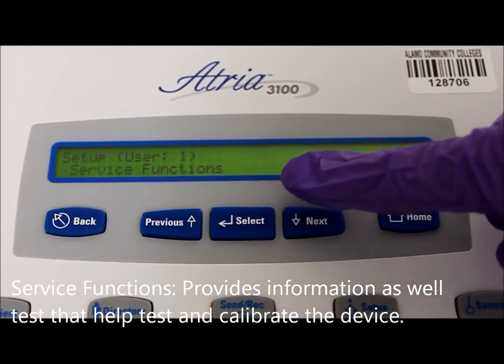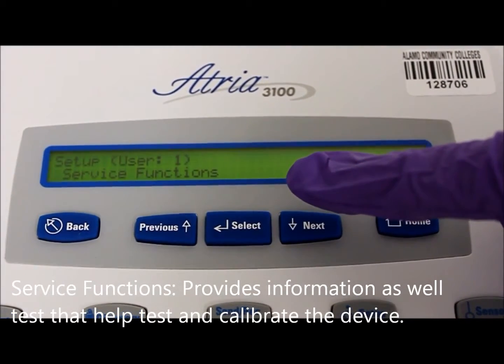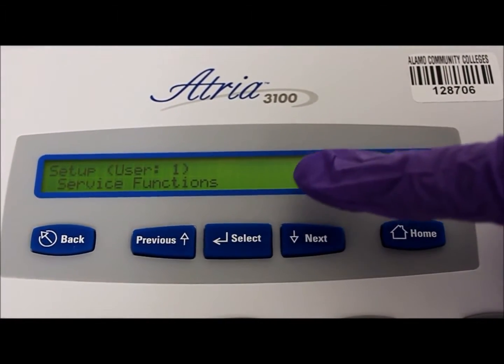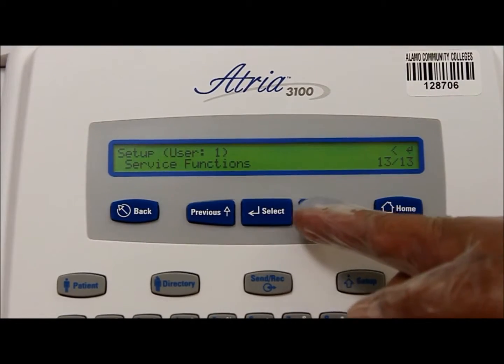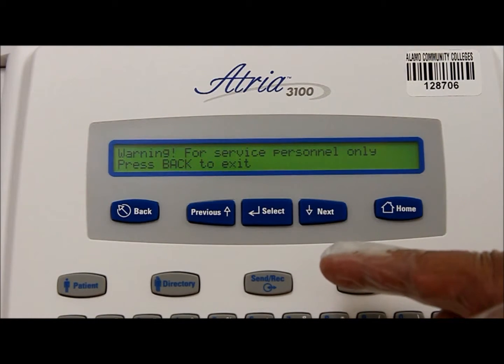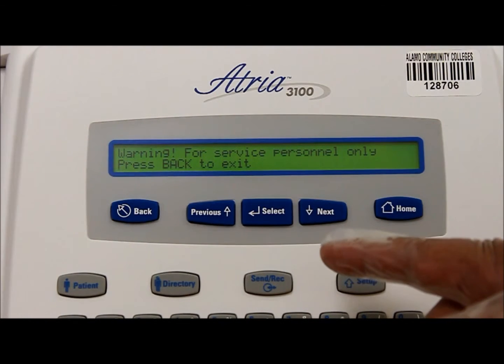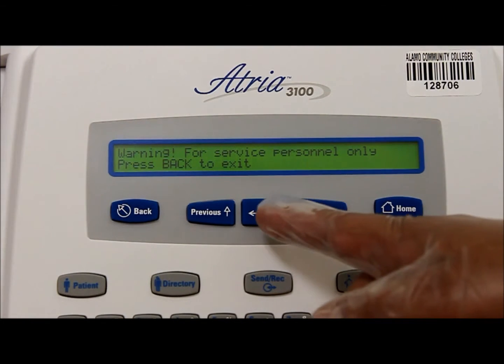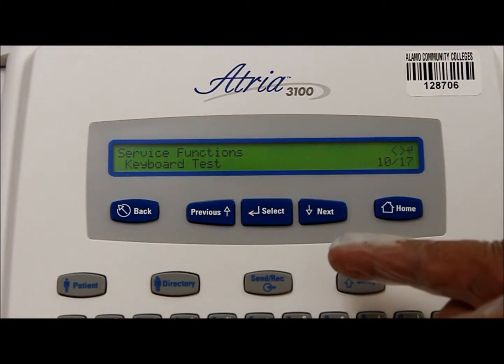Accessing the service function. The service functions can be accessed by pressing Home, then Setup, and then scrolling to the service functions and the display. Another option is to press Home, Setup, Shift, and then Stop and Enter at the same time. If the administrator password has been set up, you must enter the password to access the menu.